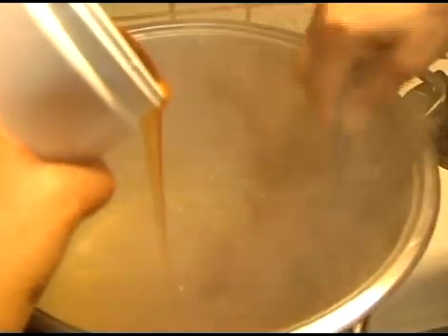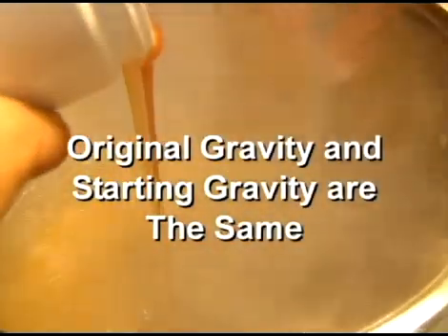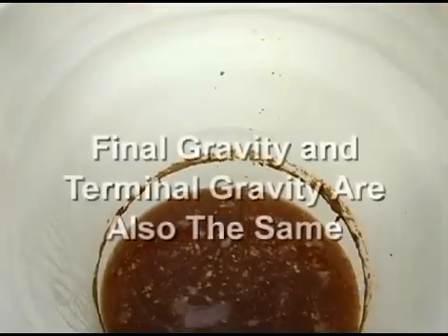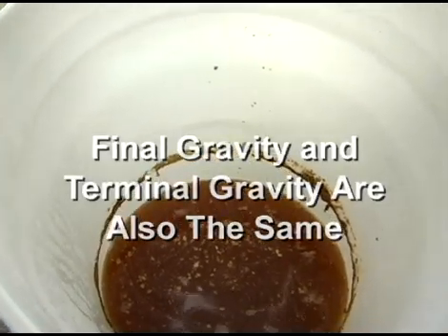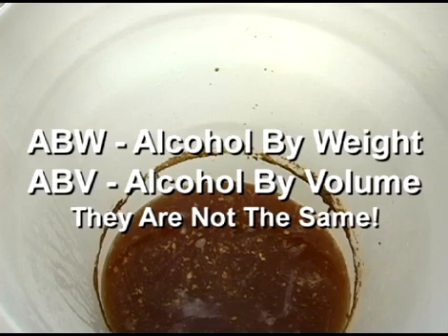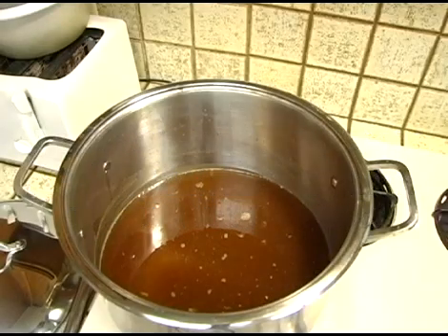In brewing, a hydrometer provides some important and helpful information. First, a hydrometer will tell you the original gravity or starting gravity of your unfermented wort. A hydrometer will also tell you the final gravity of your fermented beer. Hydrometers can also tell you if your wort has fully fermented or if fermentation is still going on. Hydrometers also provide you with the ABV or alcohol by volume of your beer. And finally, they can read the total sugar content of your wort.